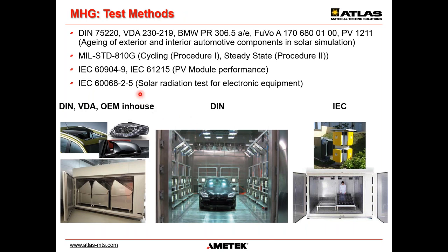Here you see the test methods for metal halide based testing, and you see this is big in the automotive industry, big in the military industry, big in the electronics and the PV module testing, and here pure electronic equipment. So it's basically three fields where they do really performance tests. How durable are these photovoltaic panels under complete solar load, and how much electrical power do they produce? And the same for this external pieces of electronics. And of course, it will become more and more with all these autonomous driving robots that go around your front yard or doing harvesting in the fields and so on.